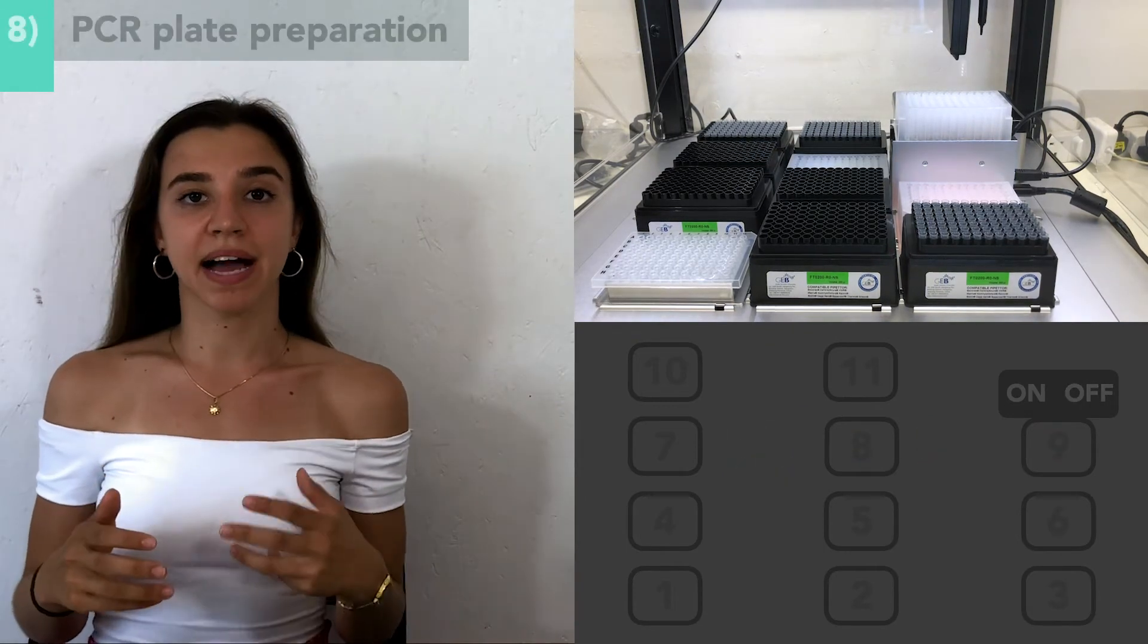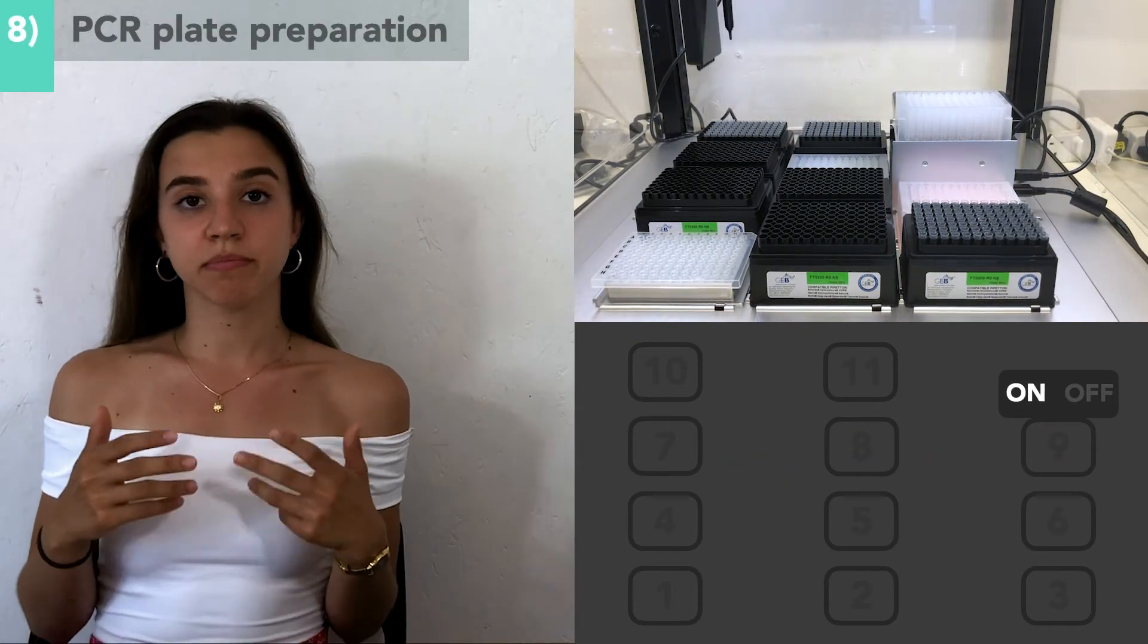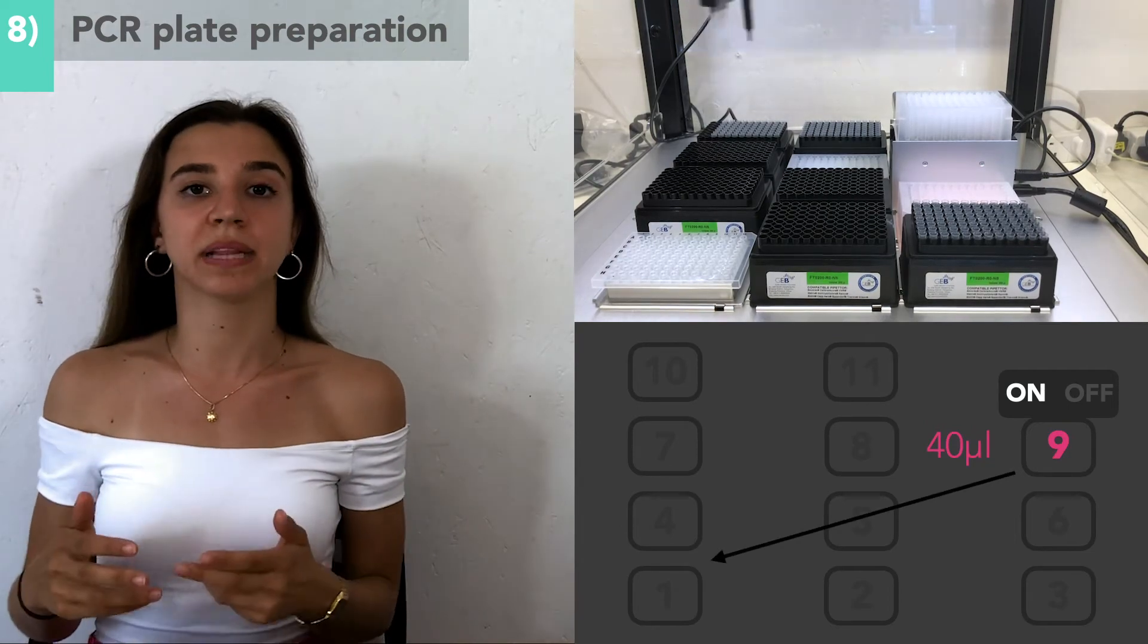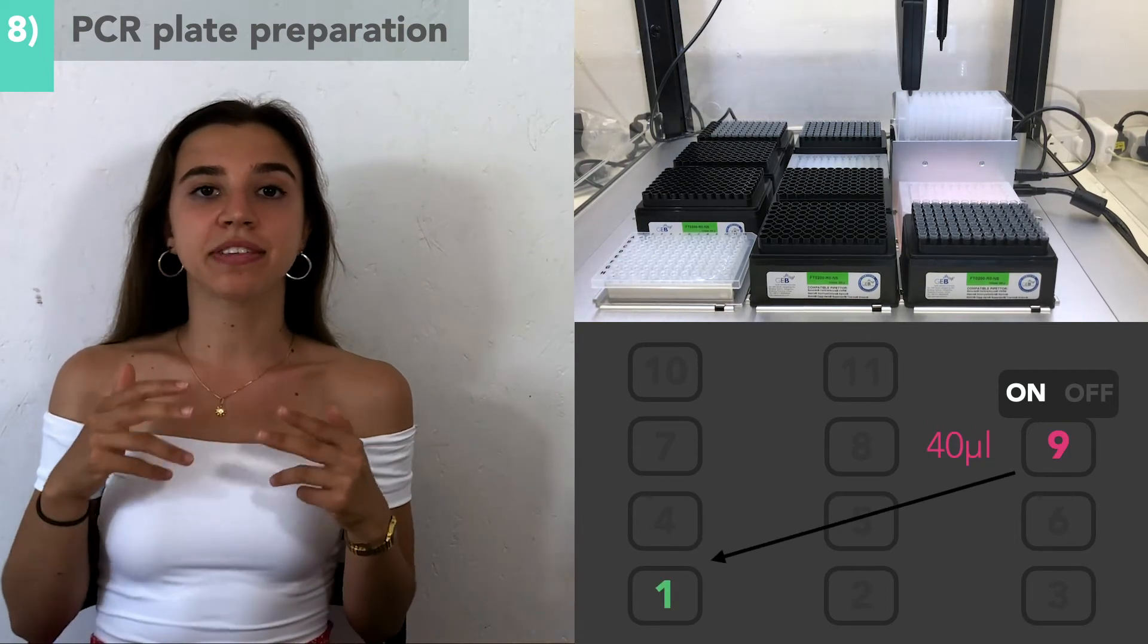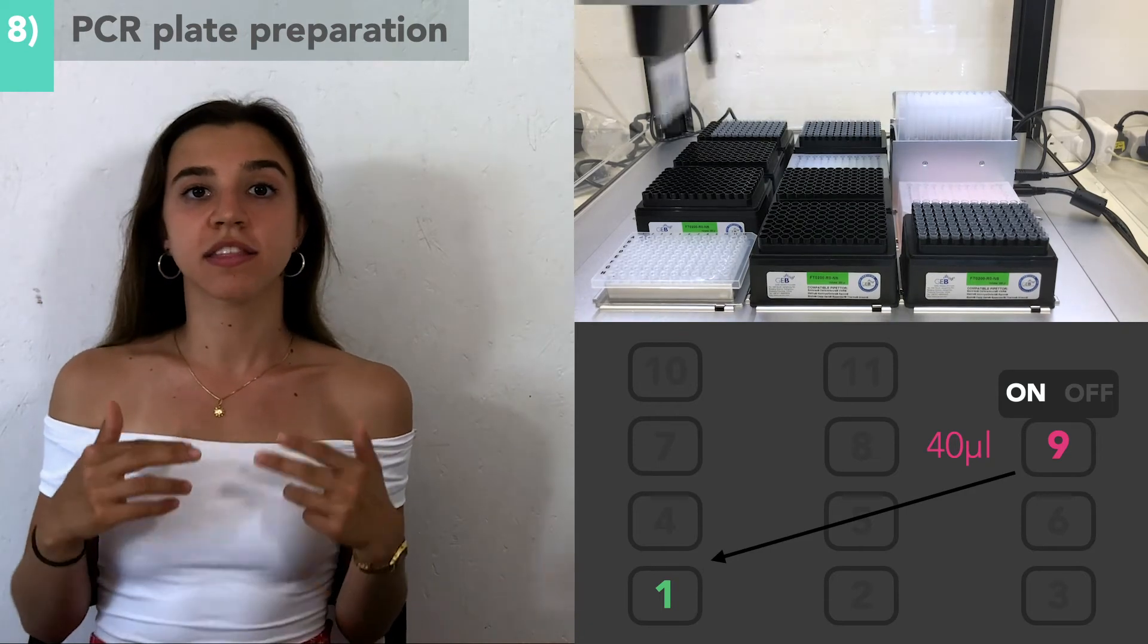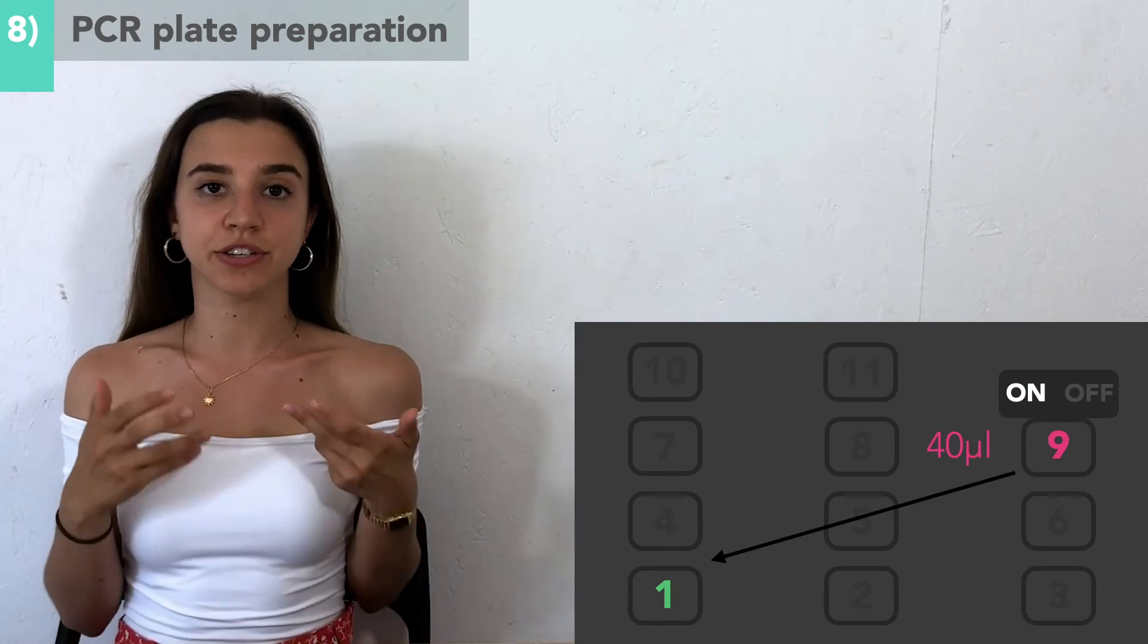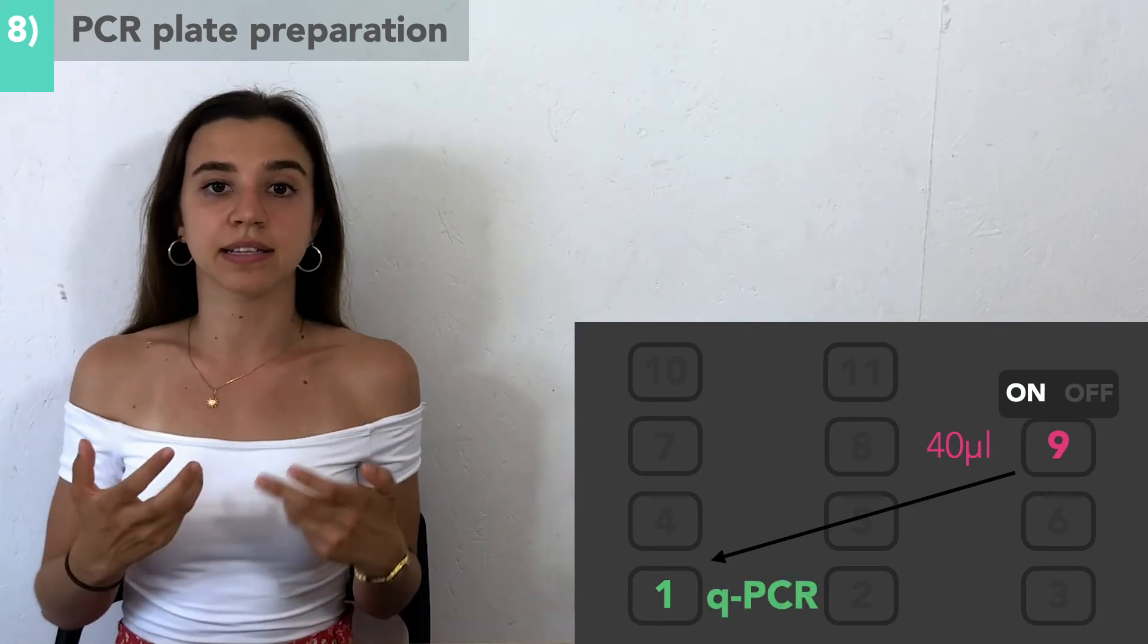In the final stage, the magnet will be turned on and 40 microliters of the supernatant will be transferred to the 96-well plate in slot 1. At this point, the supernatant contains the valuable RNA that we just extracted. This PCR plate can now be used in Station C for qPCR analysis.